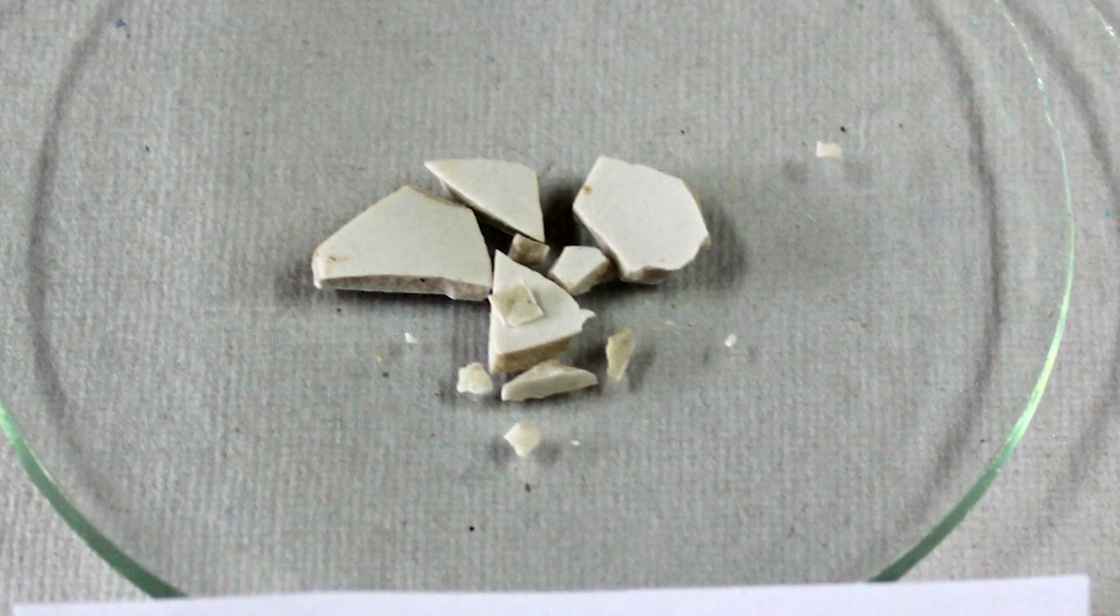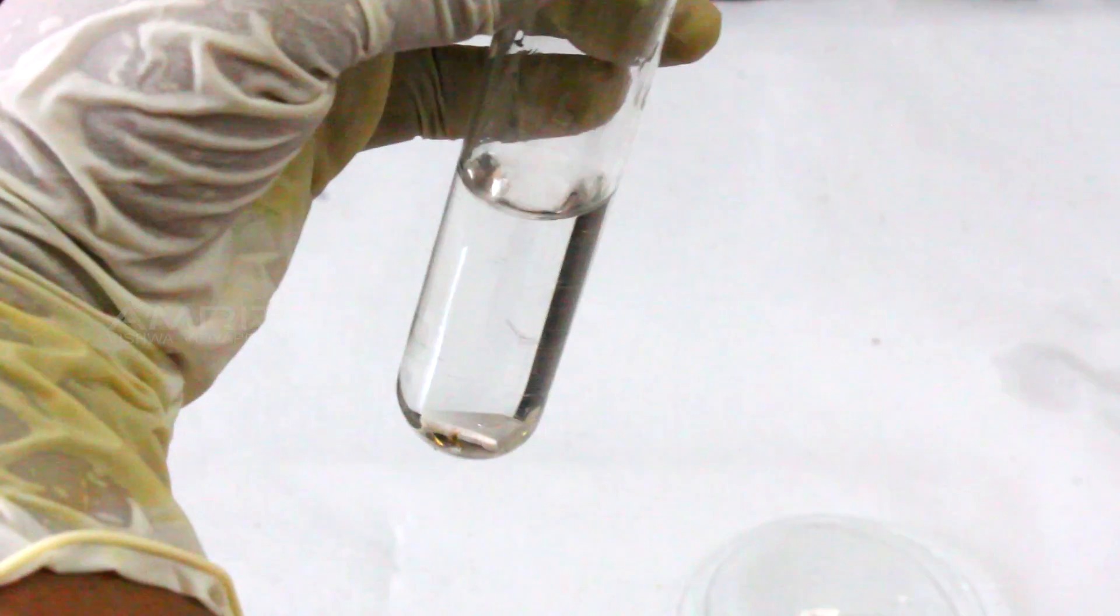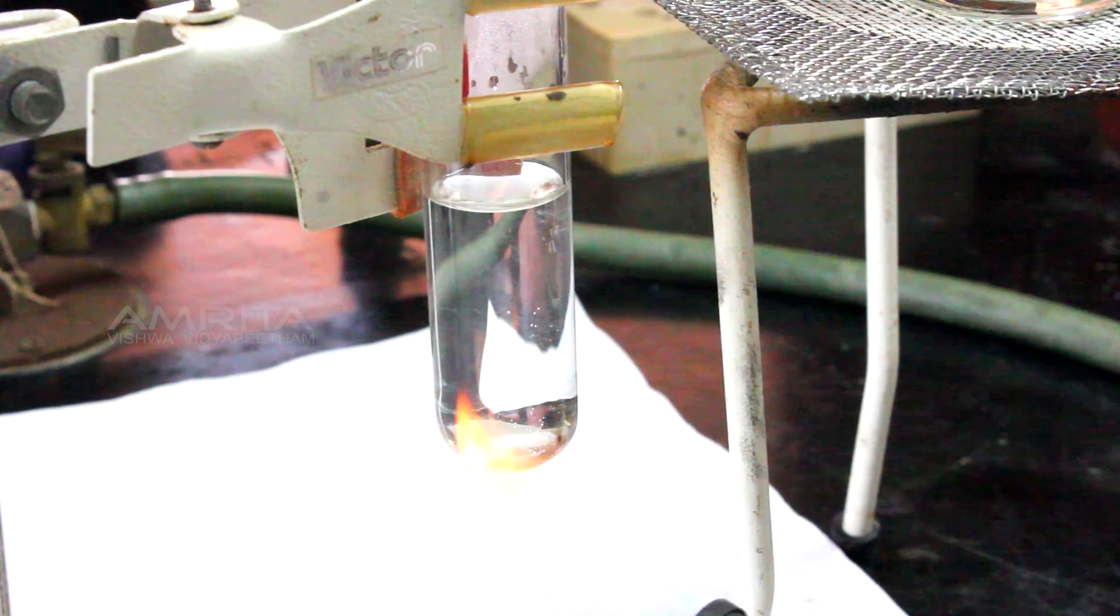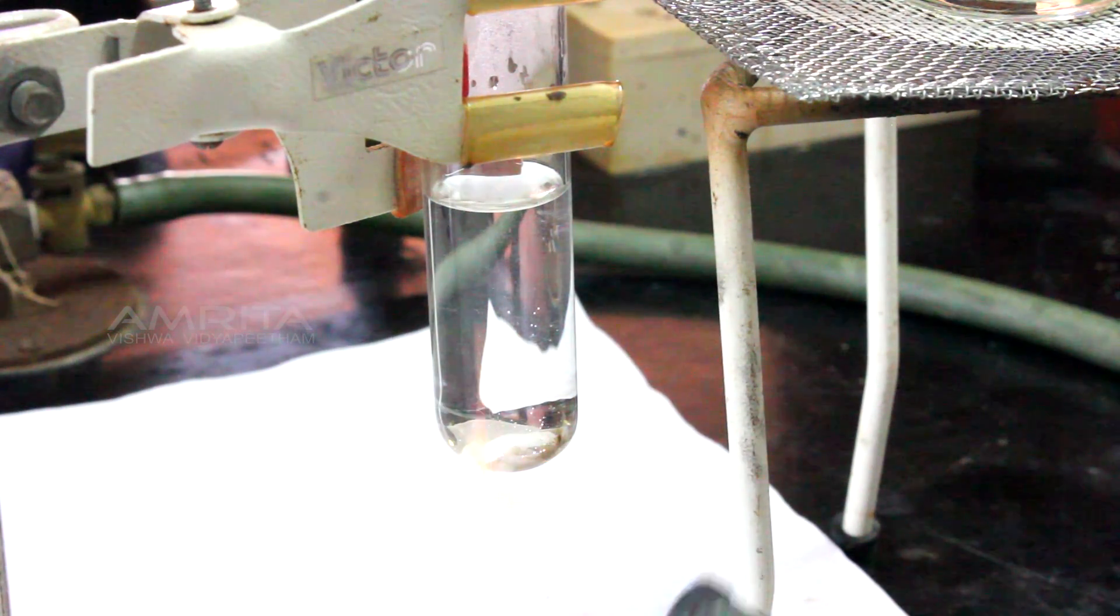Precautions: Pieces of porcelain chips should be added to the water before heating the boiling tube. Water should be heated only by rotating the tube over the flame.